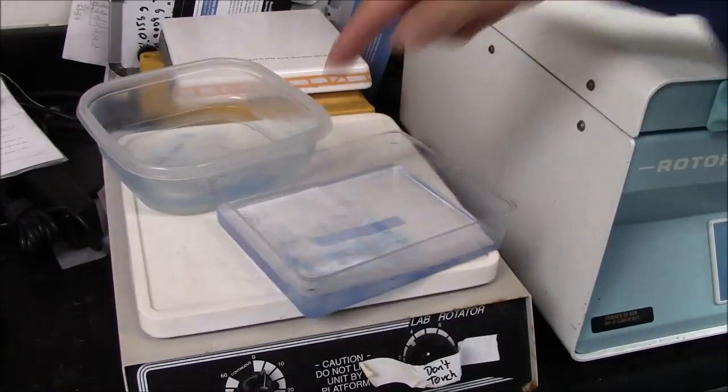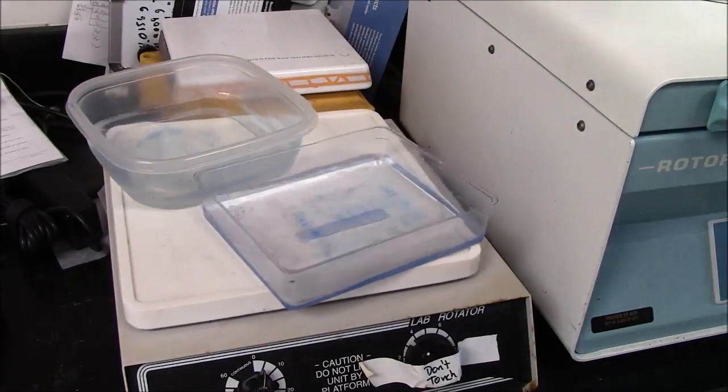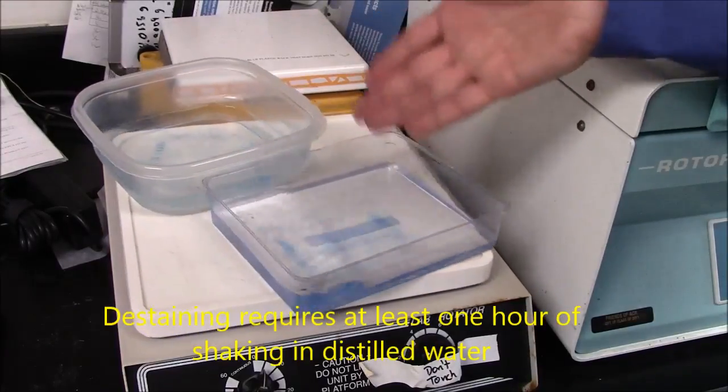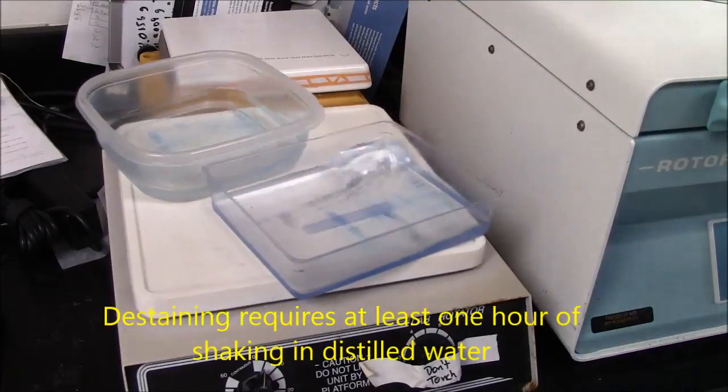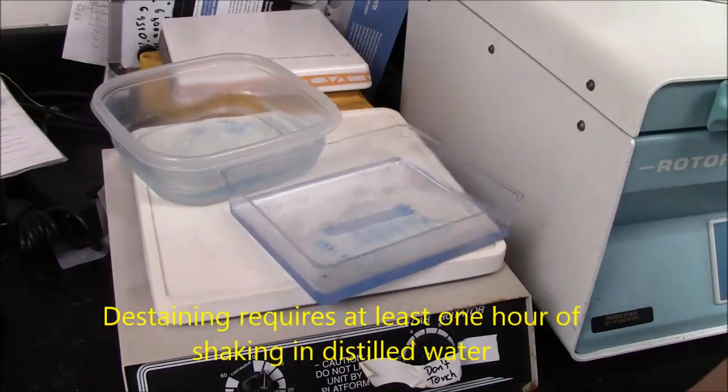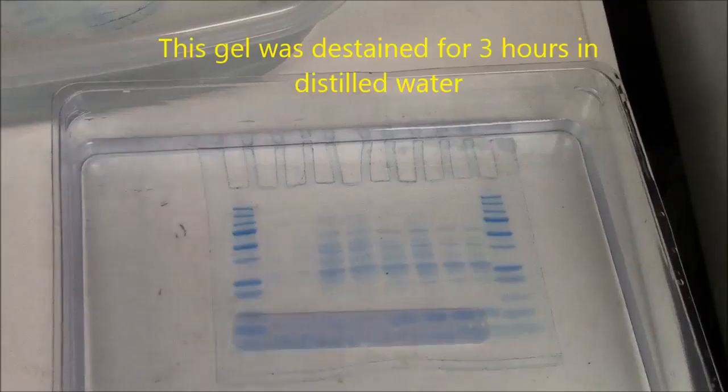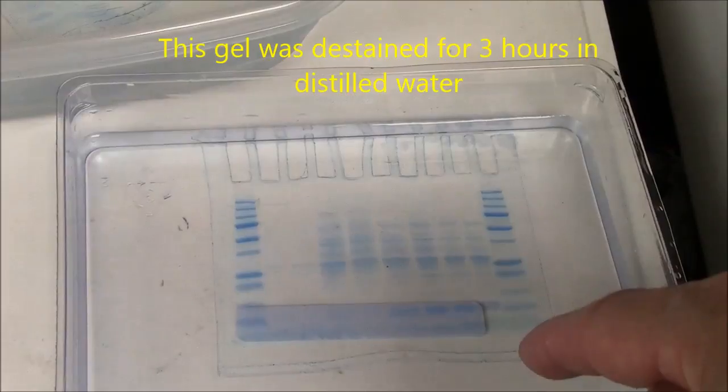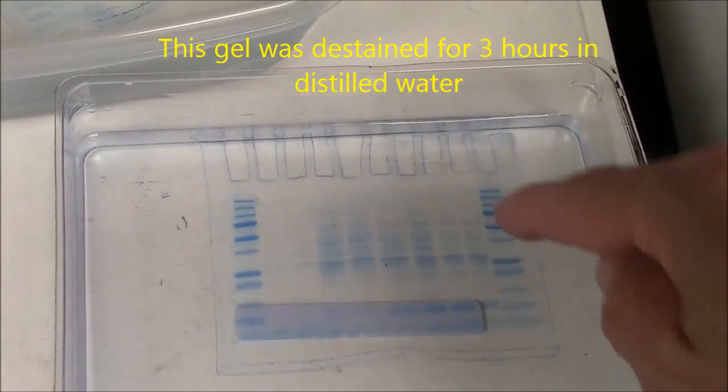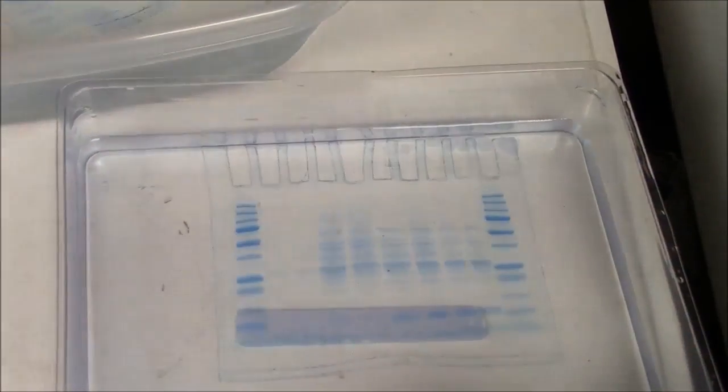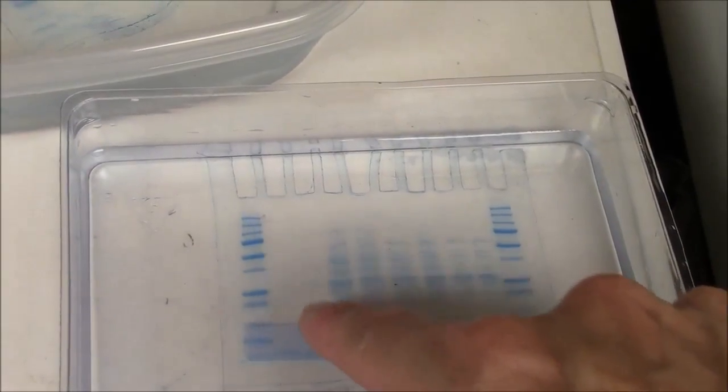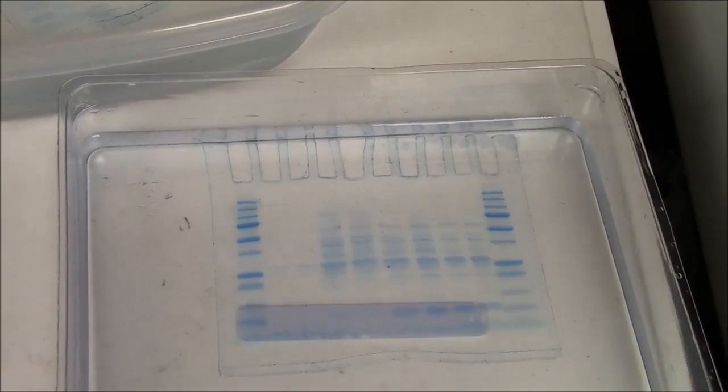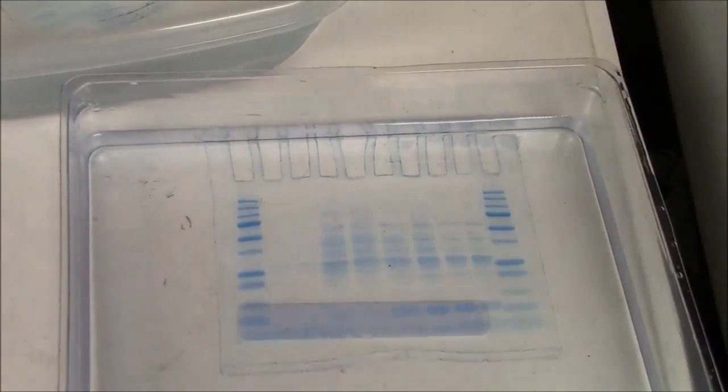As the gels are shaken in distilled water after the staining, the excess stain that's in the gel itself comes out and the bands of protein appear. I'll give you a close-up of that. Here you can see the marker lanes clearly visible with defined molecular weights. And these are the periplasmic extracts. These lanes here show very little protein. So somebody's periplasmic extract didn't work very well or they did not pipette well into the gel.